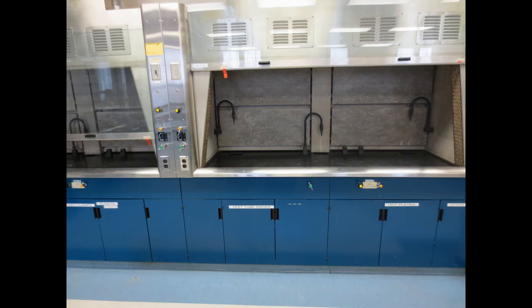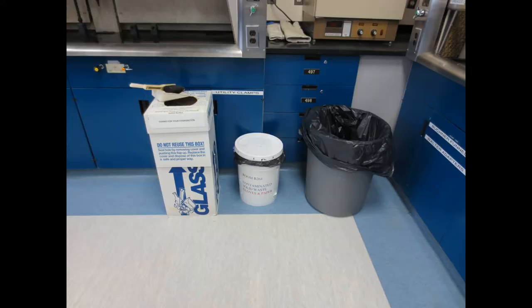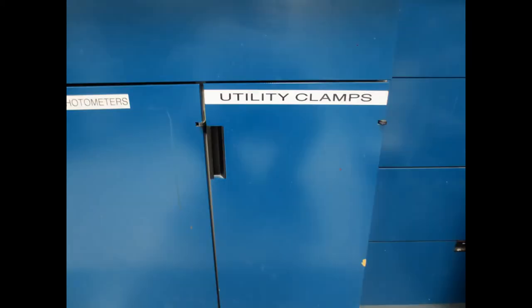Here is an overview of the cupboards and cabinets right next to the door. There is a glass waste bin, a contaminated waste bin, and a generic waste bin. Utility clamps.